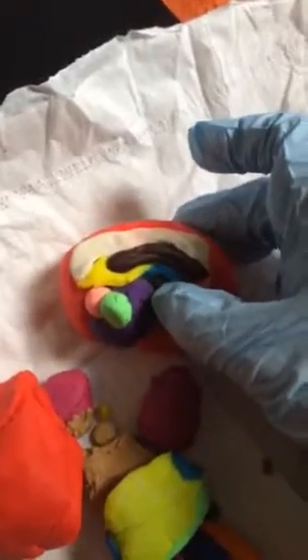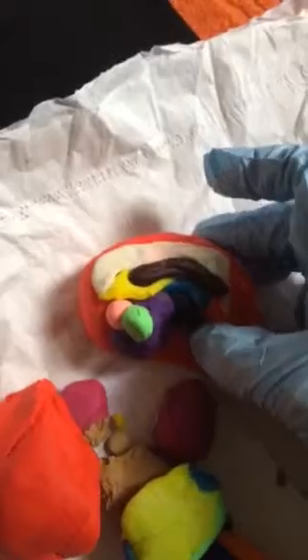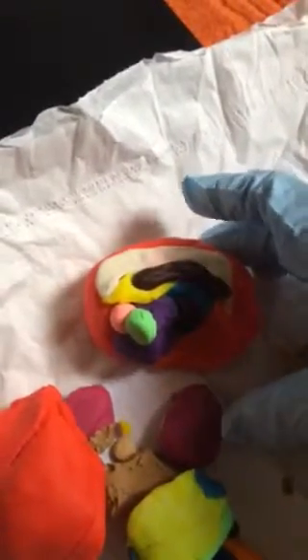If I look at my brain from the side view, here's the corpus callosum here with the fornix. This would be the third ventricle tucked back in there, with this black region being the cerebral aqueduct that connects the third ventricle to the fourth ventricle.